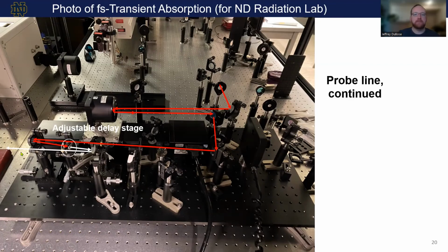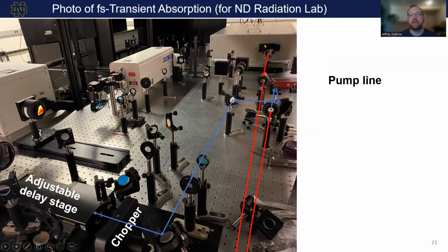Let's go back to this view and think about what's happening with the pump line. The 800 nanometer light comes out of the laser. Part of it originally went this way for the probe line, but we're going to focus just on the pump line. It's going to go through here. It's going to hit a mirror that's not shown in this photograph. It's going to bounce back, and it's going to hit this guy. This is where the actual BBO crystal is going to frequency double the 800 nanometer light up to 400 nanometers, and that's what we're going to pump most of our system with.